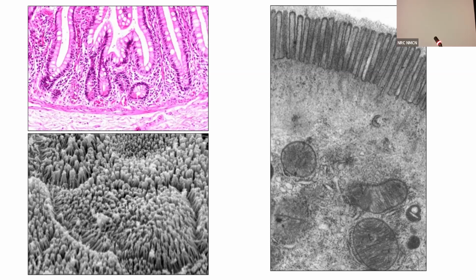Electron. Now you understand the differences. So the scanning just looks at the topography. What we'll do is take a section of the tissue and just stick it on the holder, and we can detect it in the scanning electron microscope, just like this. So what we are trying to see is the surface.